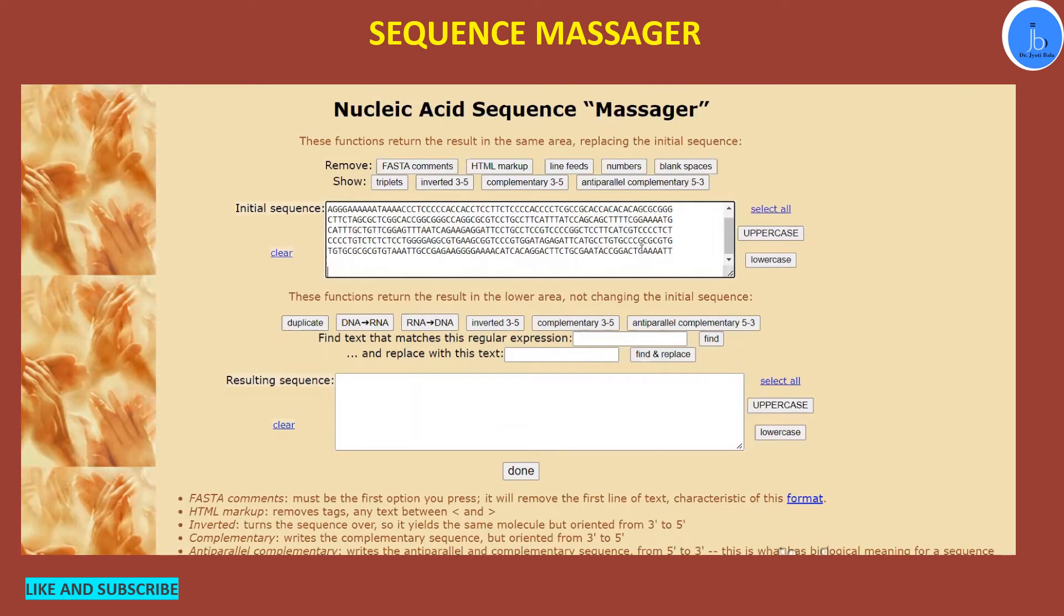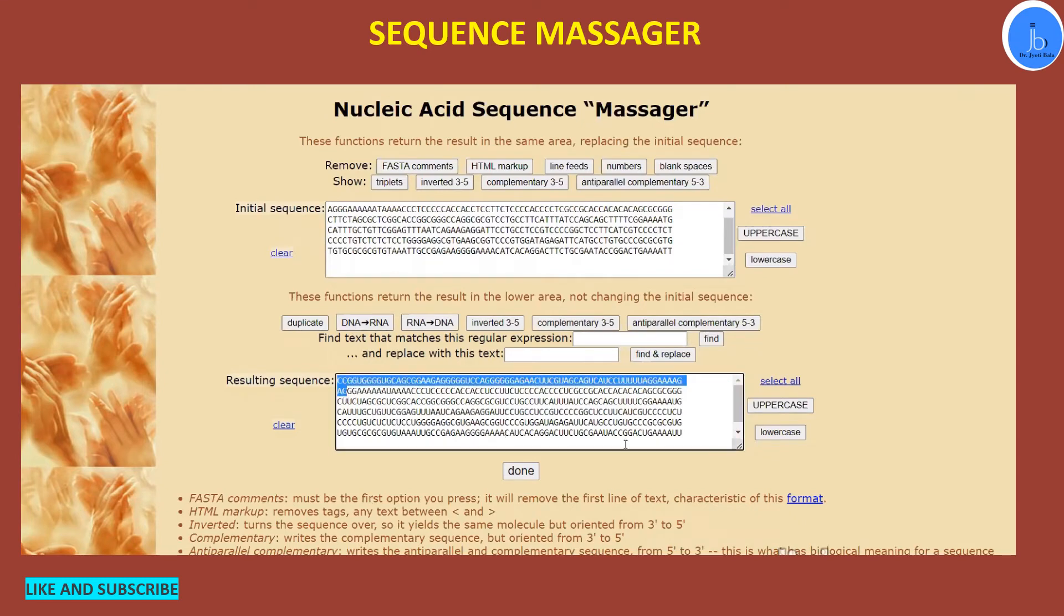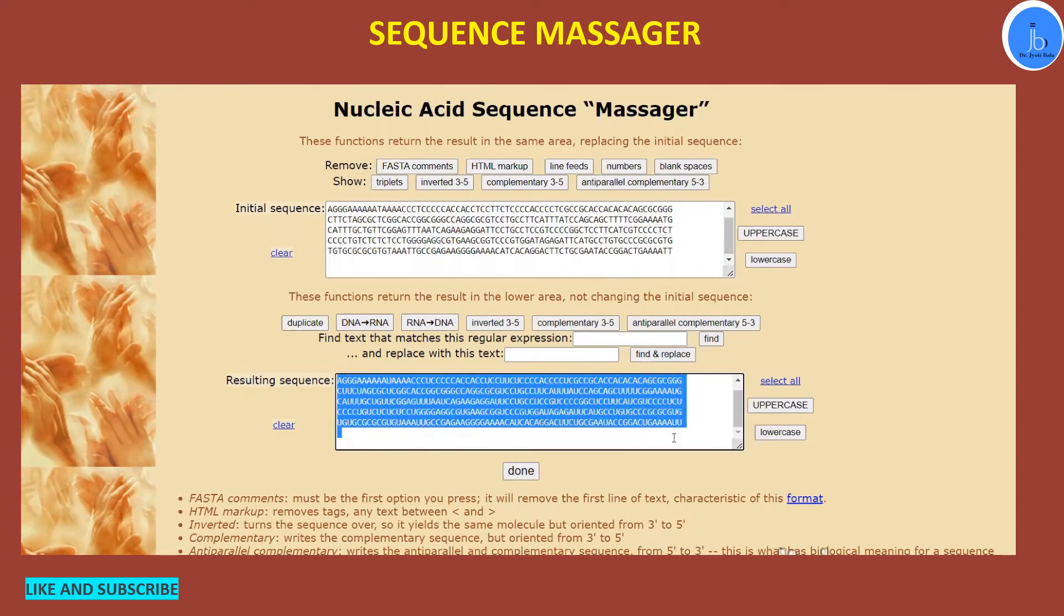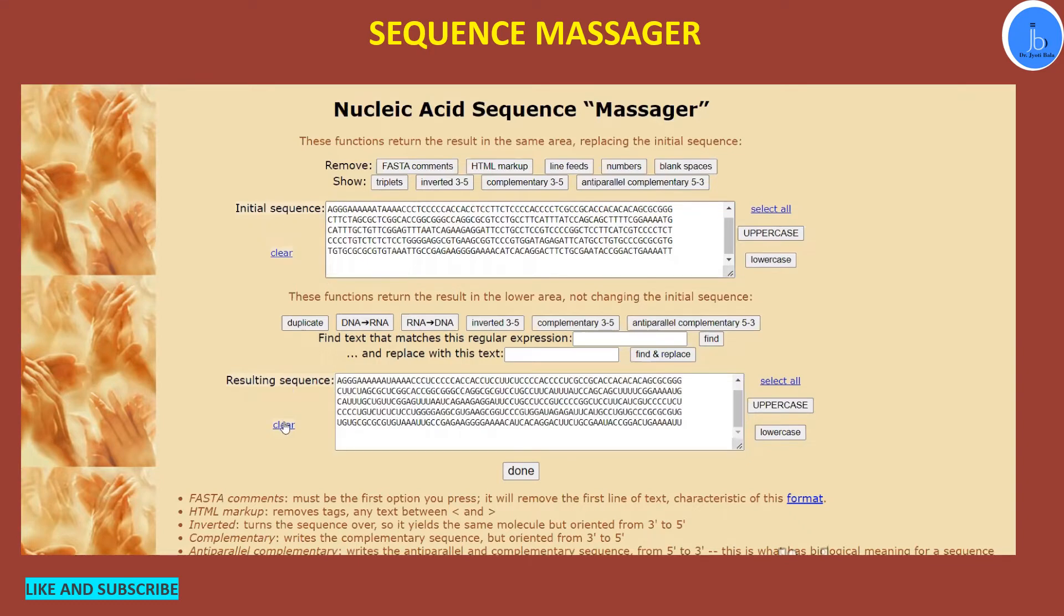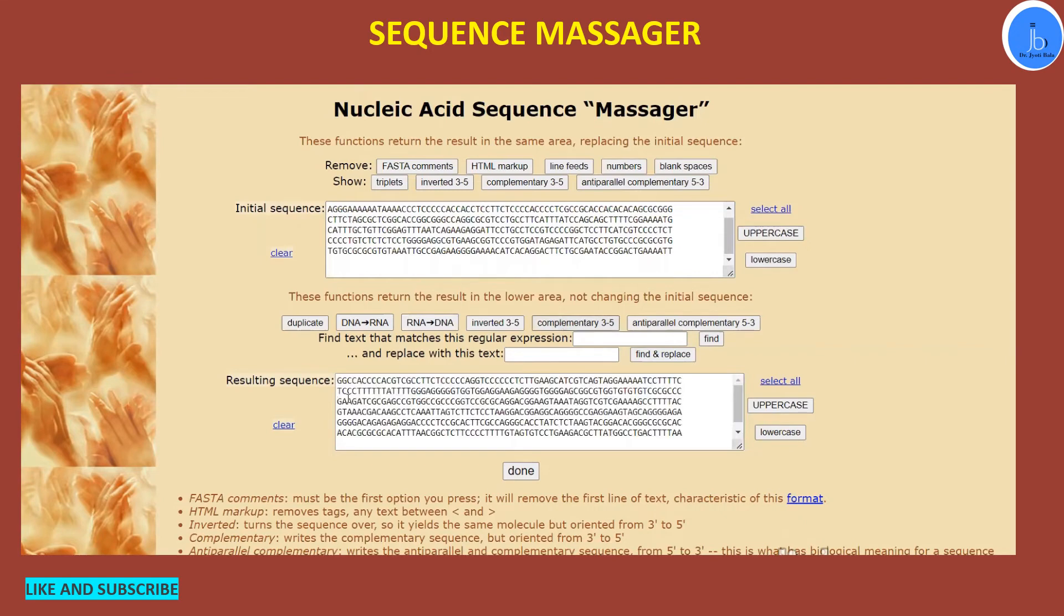So suppose this is my DNA. If I have to convert it into RNA, then I have to paste my sequence here and then I have to click DNA to RNA. So here in the result section, you will get your DNA converted into RNA. This RNA you can utilize for your different purposes.